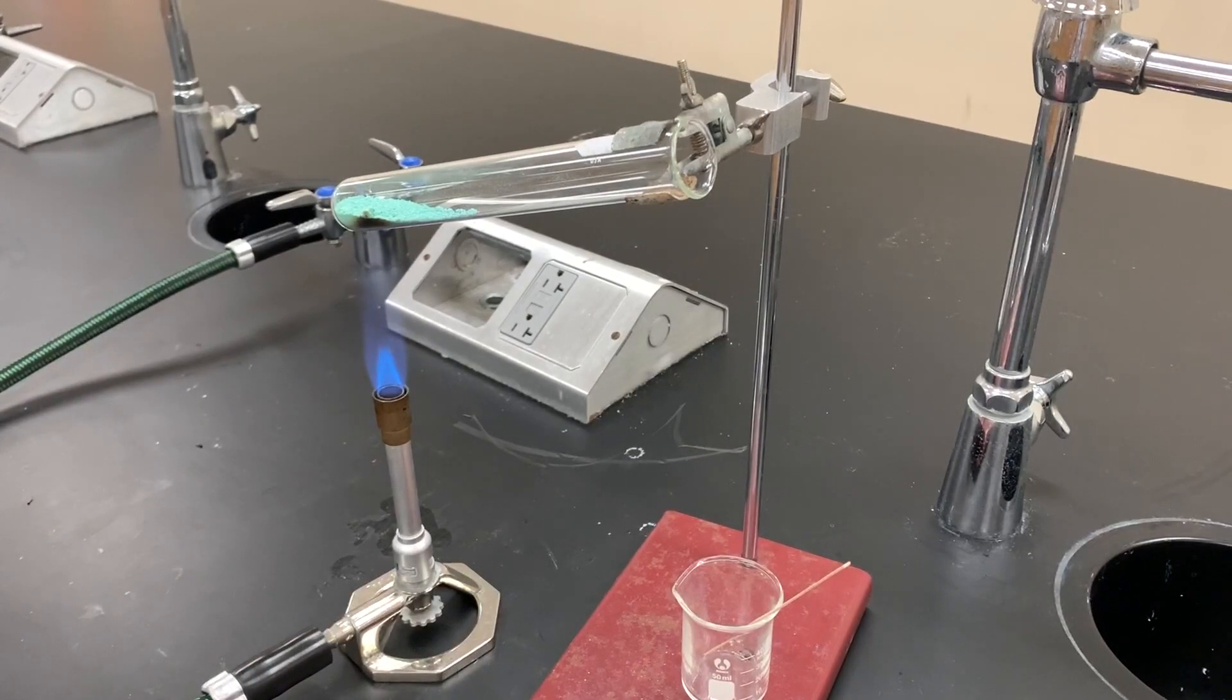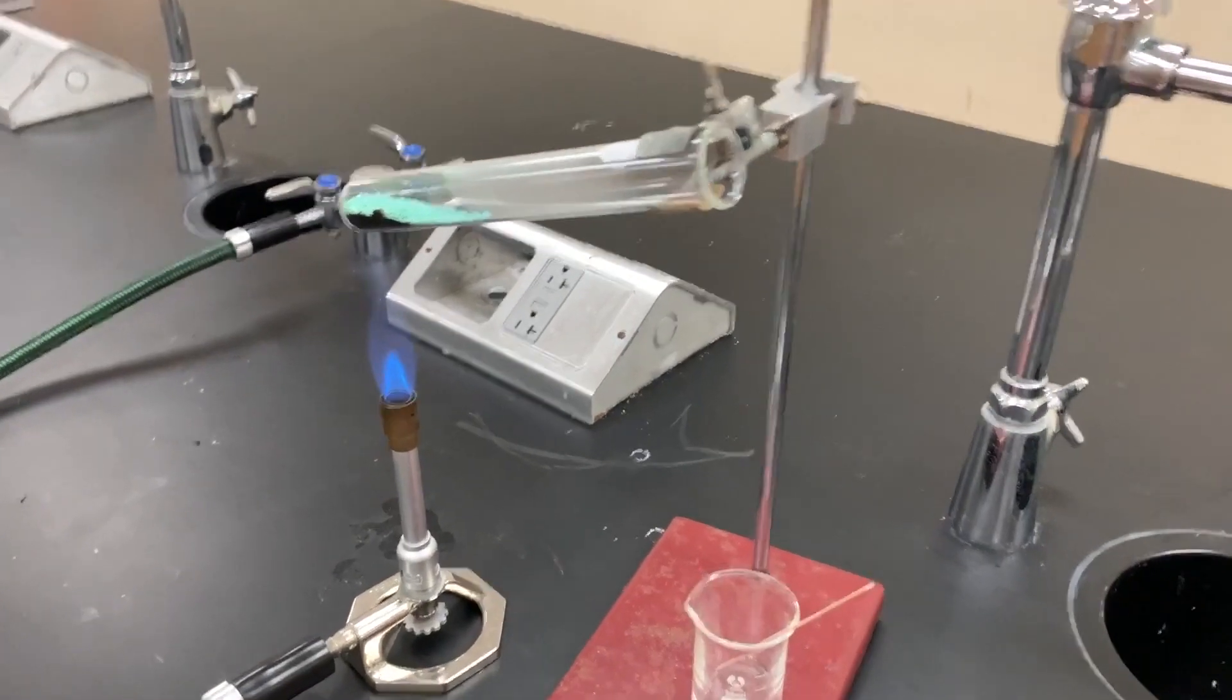First thing you want to do is start looking for signs of a chemical change. If you read the pre-lab, there is a color change that shows copper two oxide is forming. We also want to look for evidence of the other products: carbon dioxide and water. I'm going to zoom in and show you what it looks like.